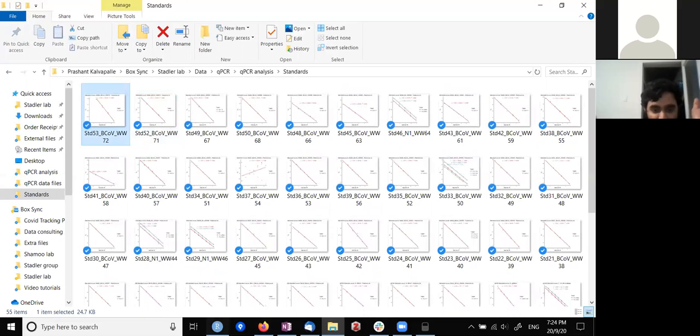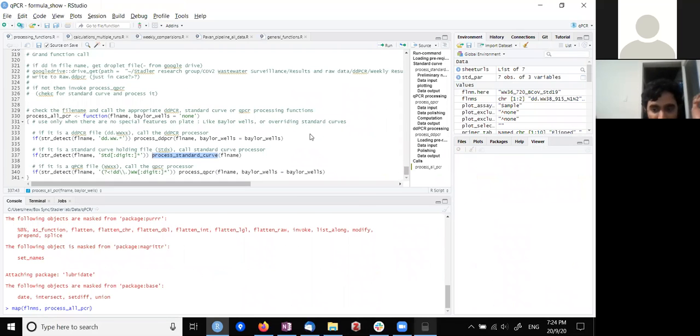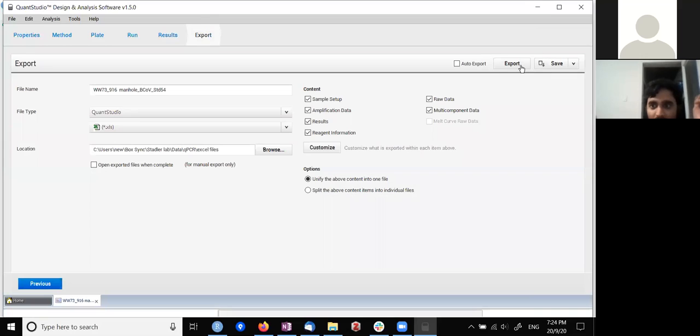So for example, if we took this, let's actually export this data and see what it looks like.